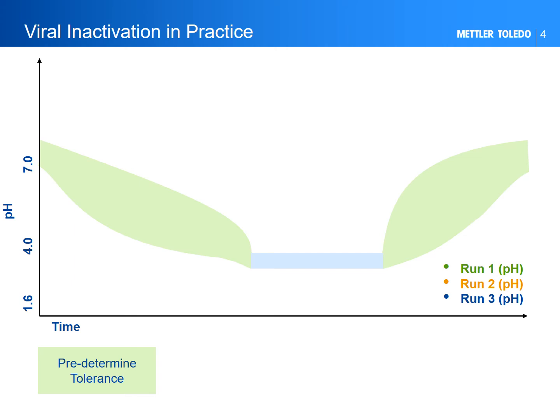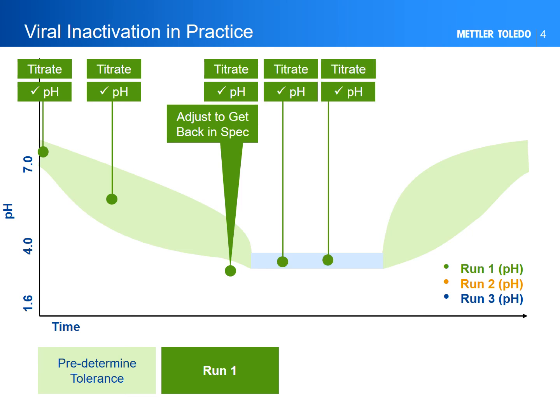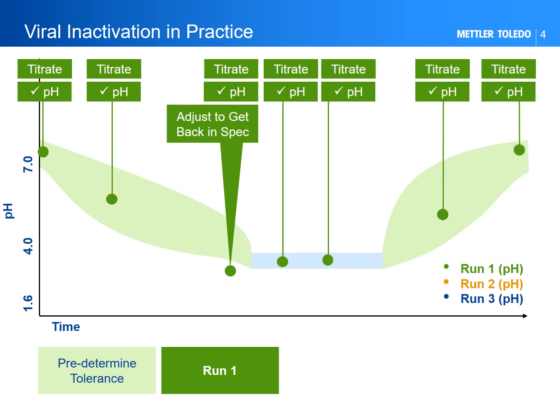In a typical manual process, an aliquot of acid titrant is added and allowed to mix for a period of seconds. For traceable recording, the pH is checked by a standalone meter, of which the measured value is generally recorded manually. Even if automatic, the value is recorded as a single time point and later correlated to a titrated volume.